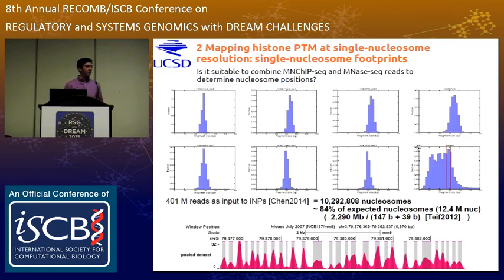We also supplemented our MNase ChIP-seq libraries with MNase-seq data from Carone et al. This is a publicly available data set. However, in their protocol, they were also interested in determining the position of molecules smaller than nucleosomes, like transcription factors, so they have a heavy tail on this side.